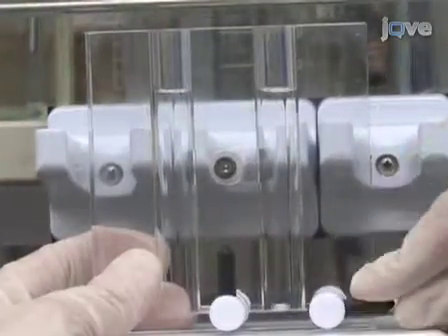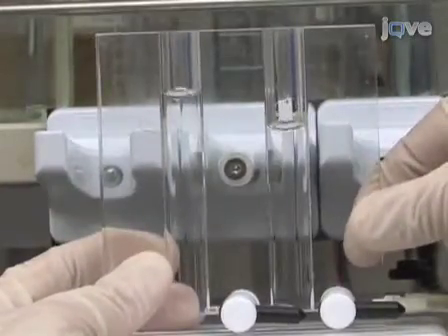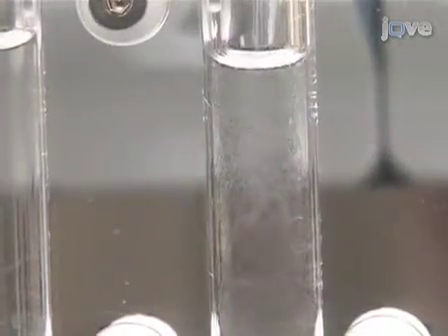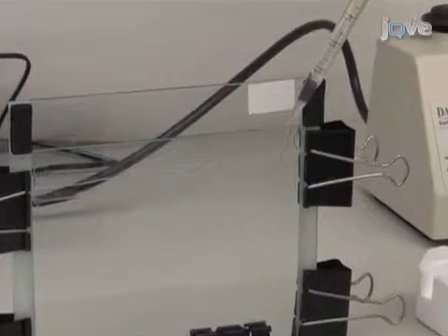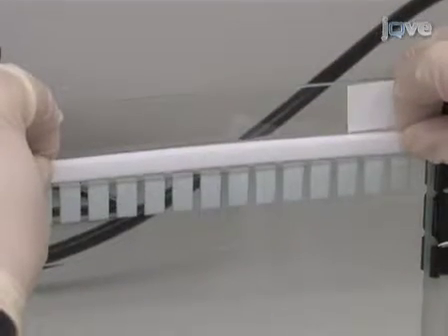We start to pour the gel by opening the right part of the chamber, then immediately open the left part and let the 5% solution mix with the 13% solution to make the gradient. We add a small amount of isopropanol to the top of the gel to form a sharp, straight border after polymerization. Approximately one hour later, when the polymerization of the gradient gel is complete, we remove the isopropanol and pour the 3.5% stacking gel into the apparatus and insert a gel comb.